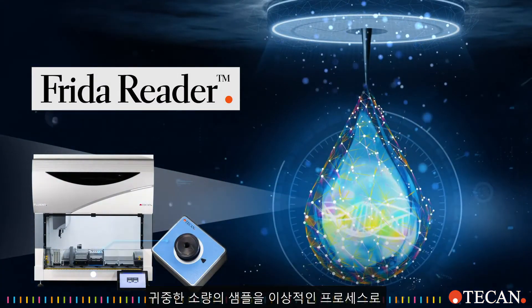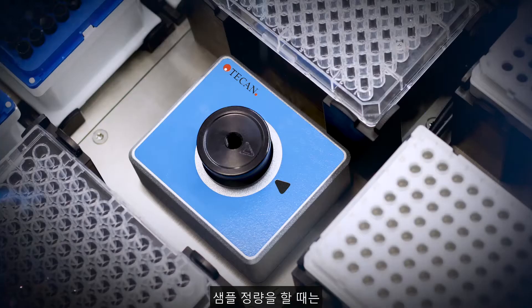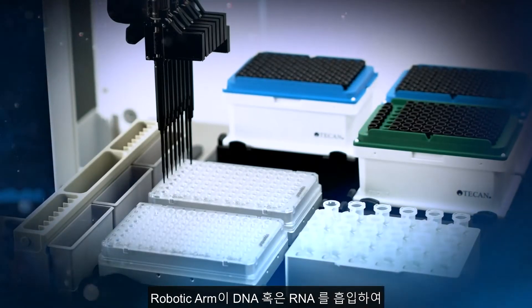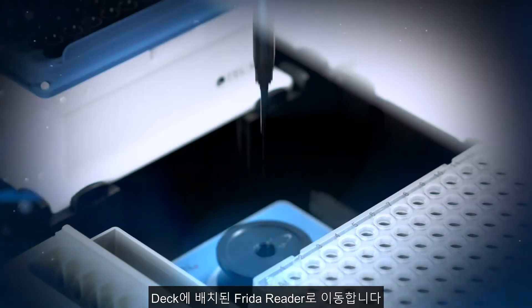Now labs can implement their ideal process for precious samples. No compromising. In a typical quantification workflow with FridaReader, we aspirate the DNA or RNA sample and move to the reader, which is integrated directly in the work table.